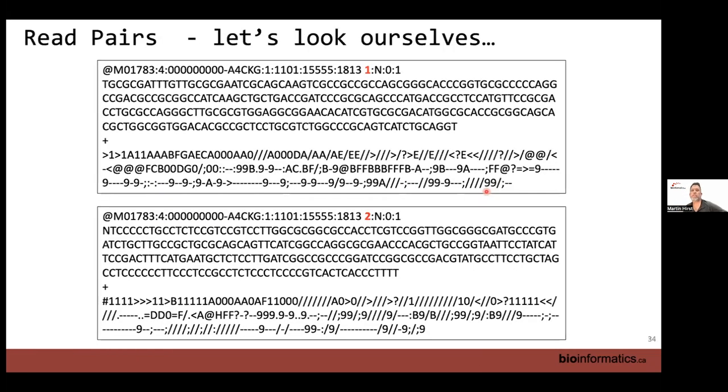And so this is actually what it looks like in a FASTQ file. Again, we can see this information, and these are two independent FASTQ files, and you can look at these yourself on the AWS data repo, and you can look for the sequence names, which will look slightly different than this, but the principle is exactly the same. And the way that we relate these to each other is again through this sequence name.